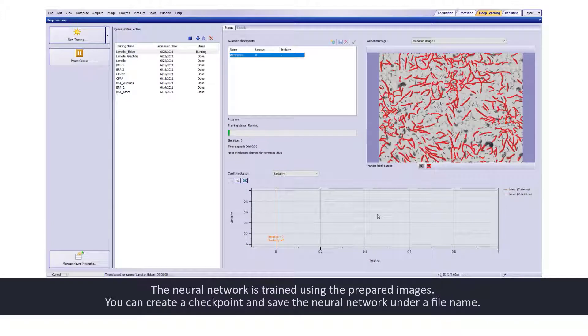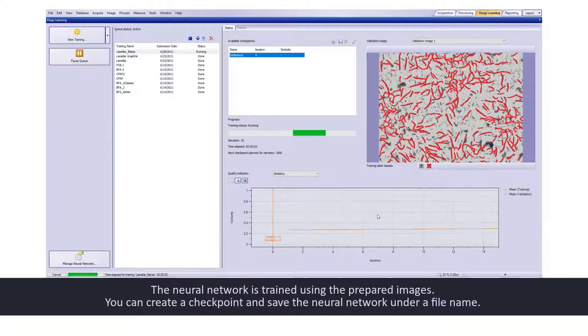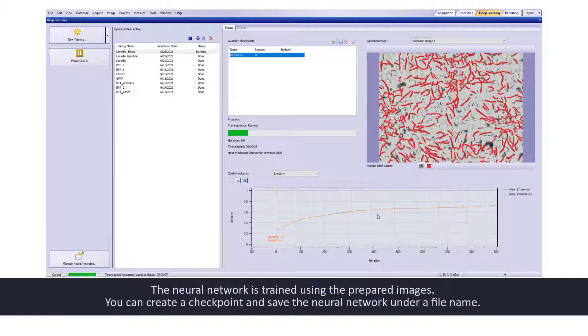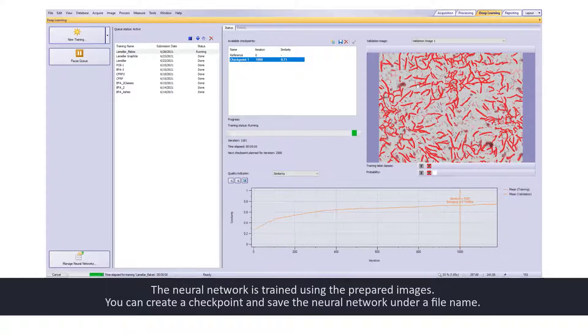The neural network is trained using the prepared images. You can create a checkpoint and save the neural network under a file name.